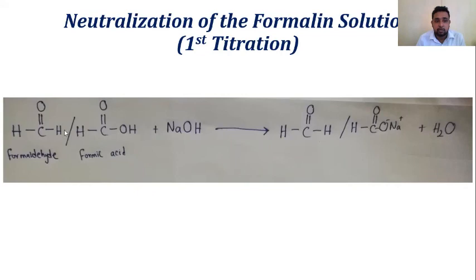Formaldehyde can react with atmospheric oxygen and further oxidize into formic acid. Even though we use a 40% formaldehyde solution, which is highly concentrated, about 10 to 12% of formic acid can be there in a commercial formaldehyde solution, because we cannot avoid the reaction of formaldehyde with atmospheric oxygen. So when we open it, it can react and oxidize into formic acid.